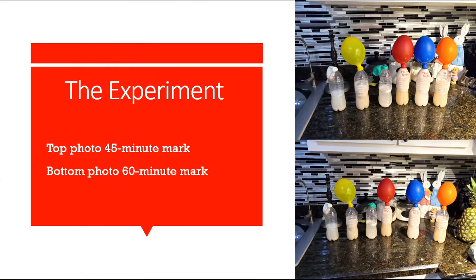These photos are also showing how big the balloons have grown with the CO2 production. The top photos were taken at the 45-minute mark, while the bottom was taken at the 60-minute mark. After this initial test, I then repeated this process 4 times to gather my data of each sugar's balloon circumference.